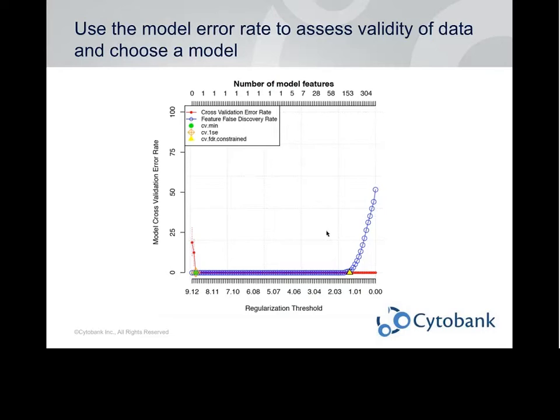This is a good time to mention that Citrus produces statistical results, and the more samples you use, the stronger those results will be. So you need at least 8 samples to have some confidence in the statistical results. Below 8, it gets a little shaky. You need at least a minimum of 3 samples per group. But again, 8 is much preferred, and above 8 is even better. So if you have maybe 2 samples per group, Citrus may not be the best tool for you, at least initially, until you can go back and repeat the experiment.